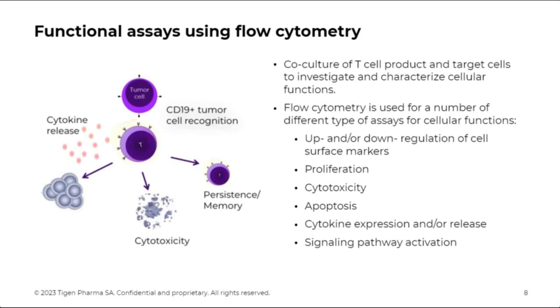In addition to looking at what type of T cells we have there, we can also look at their function, what they are doing. Often in order to trigger the cell to react, we culture them together with a target cell type. So for example, if we would have CD19 CAR T cells, which is a T cell recognizing CD19, we would mix that together with a target cell expressing CD19, which would then trigger an activation of the CAR T cell. And by doing this, we can investigate and characterize different cellular functions.